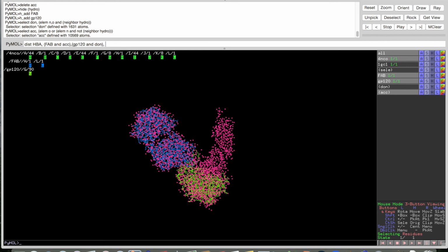I actually prefer to extend the length of the hydrogen bonds, maybe to 6 angstroms or something, even if hydrogen bonds don't exist at that distance. These molecules are not going to exist in a very stable, very still state. Brownian motion will have them move and jiggle a little bit. So for me, it's interesting to see what potential hydrogen bonds may form if the two proteins wiggle around each other. I'll leave it at 3.2 for this. You get an idea.